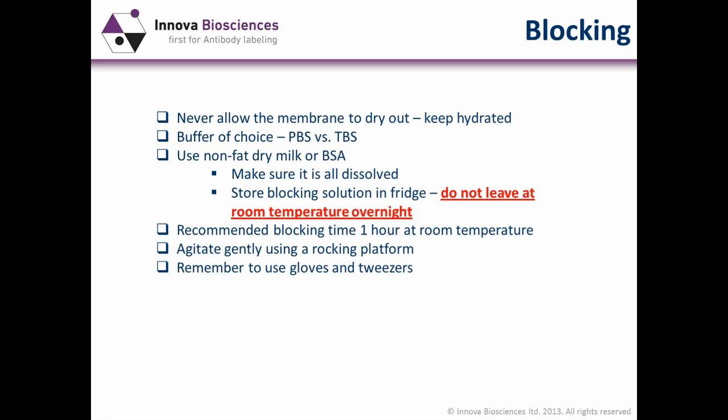We would all go home in the evening, and people would come in the next day and find their milk gone off, but they would continue with the Western blot using the same blocking solution. This is not a good practice. I would recommend putting your blocking solution in the fridge.